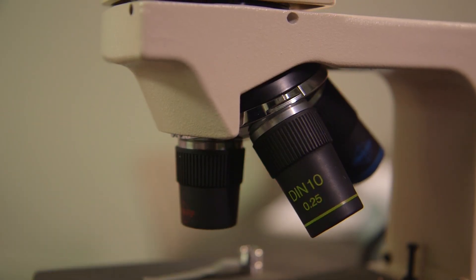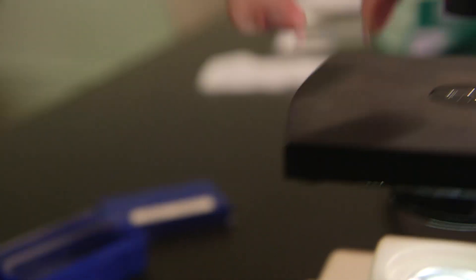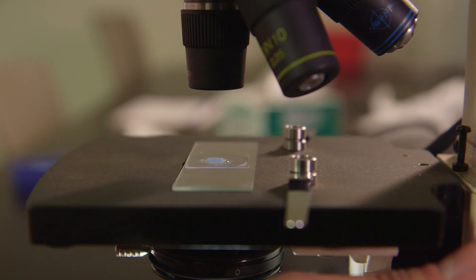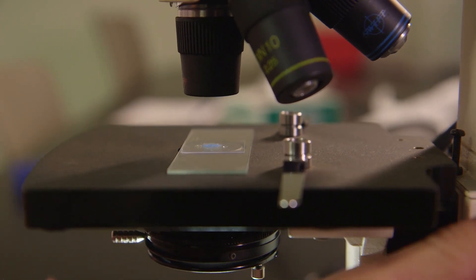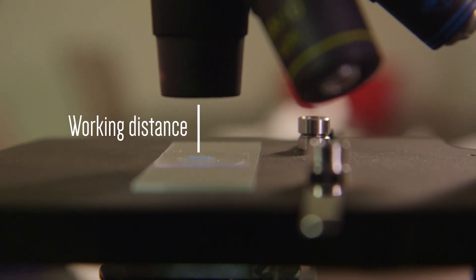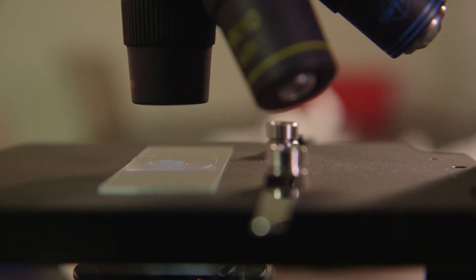To focus on the wet mount, place the scan objective, 4x, in exact alignment with the ocular lens. Place the slide on the microscope and put the magazine punch over the center of the stage opening. As you look at the microscope from the side, turn the coarse adjustment knob to raise the stage until it stops. This makes the working distance — the distance between the objective and the slide — as small as possible. A built-in stop will prevent the scan and low-power objectives from breaking the slide.